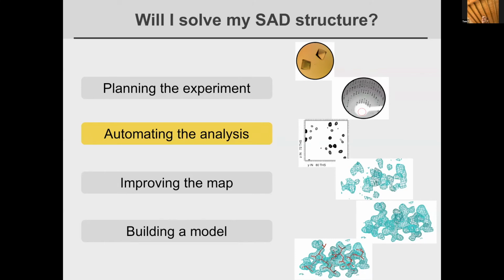Now, systematic errors are a big sort of sidebar here. If you have errors in your data that are systematic, they may or may not be fully represented in the estimates of error. Suppose you did the following. Suppose you set your crystal up and you do a small rotation and you measure the data, and then you repeat that experiment exactly 500 times.